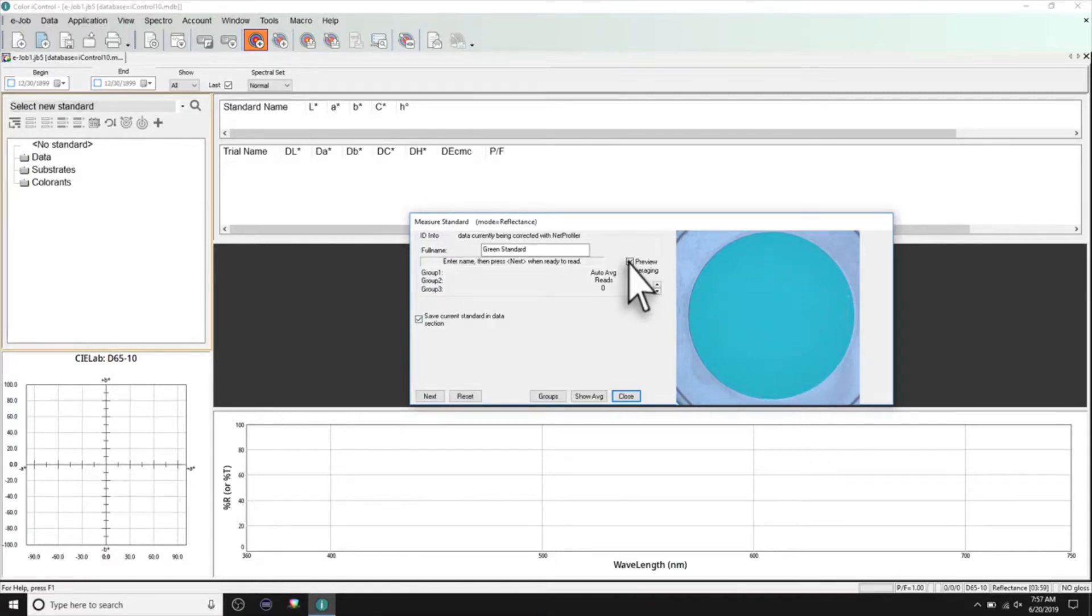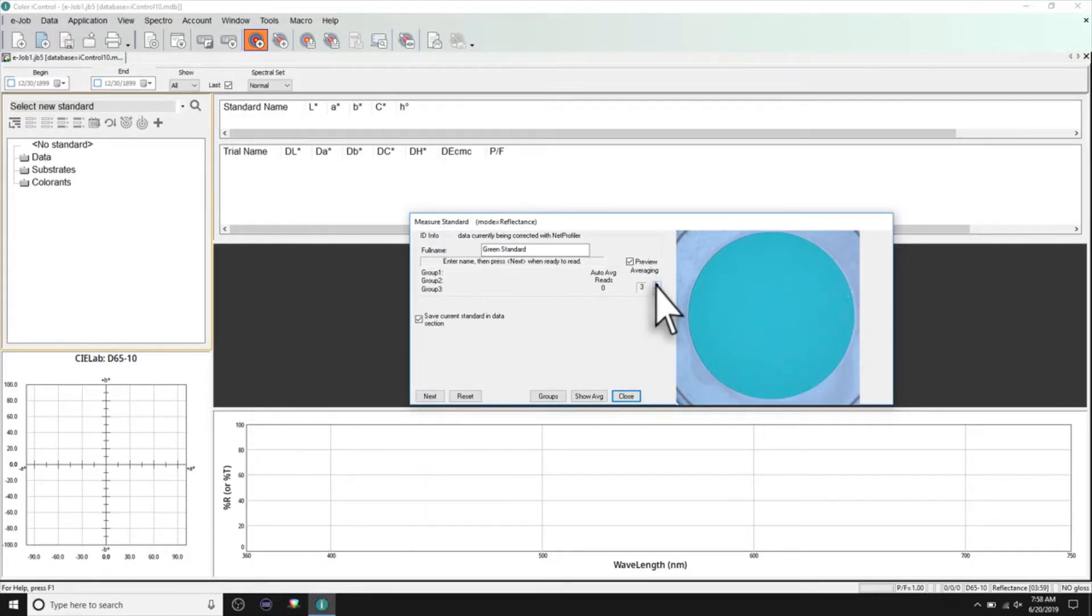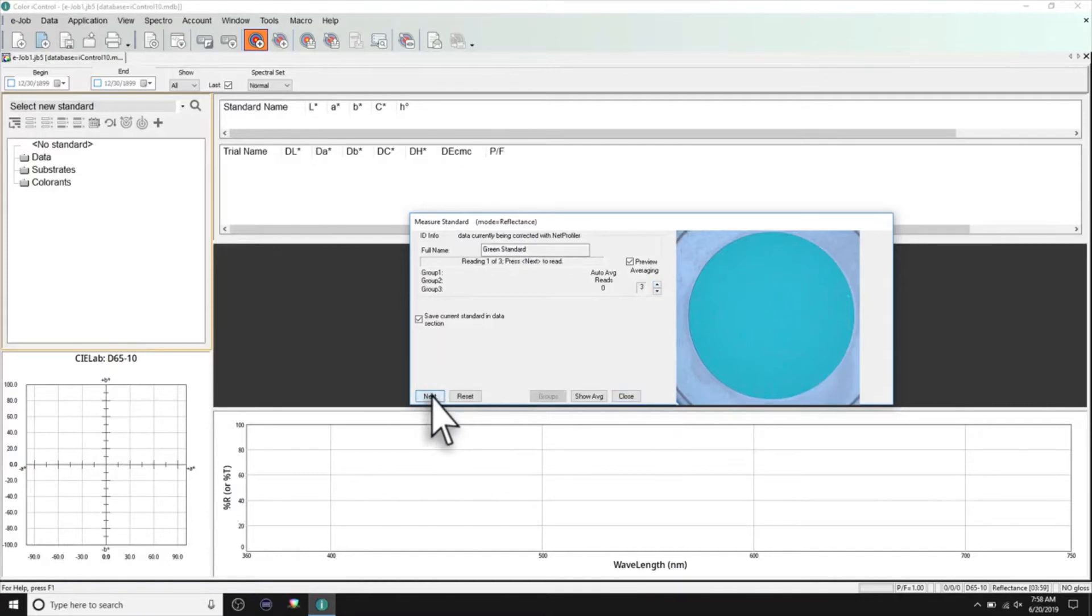Averaging can also be set. The measurement can be triggered by either clicking Next in the software or by pushing the appropriate button on the front of your instrument.